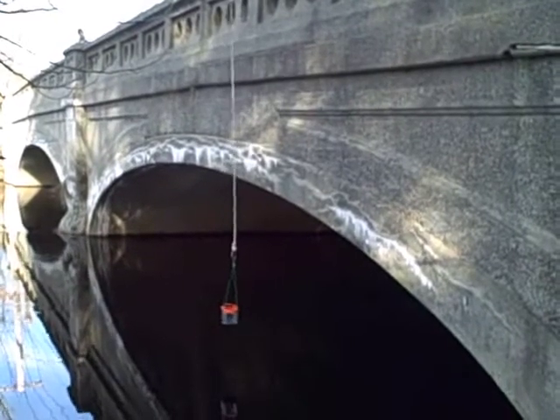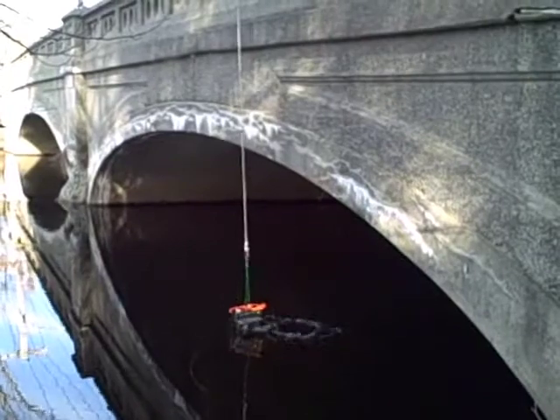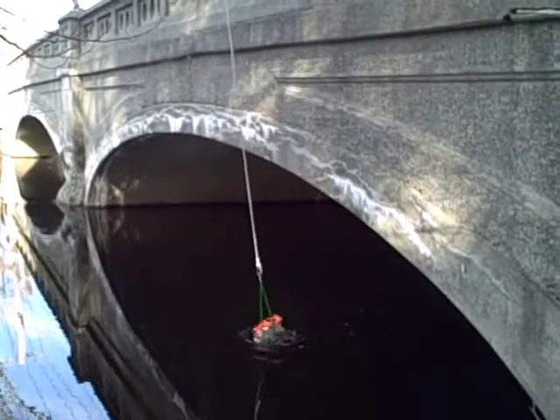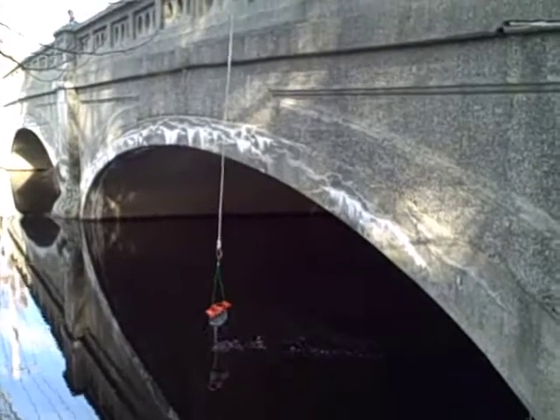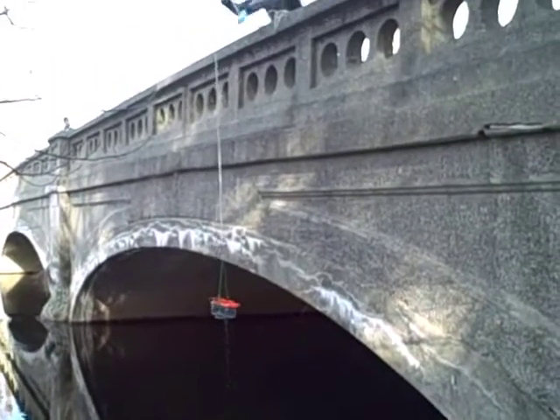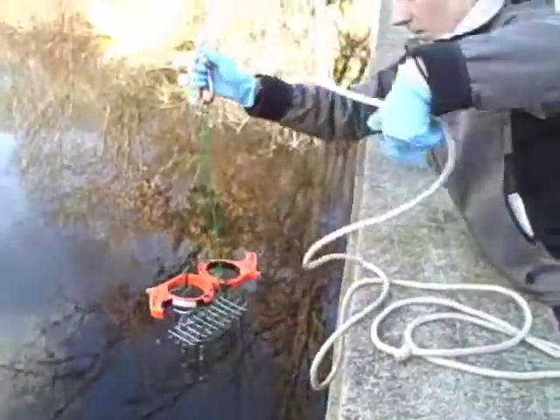Lower the basket, making sure not to hit any part of the bridge on the way down, and submerge it 3 times, so that the orange cuffs are 6 to 10 inches under the surface. You should be able to do this without getting the cloth rope wet. Once rinsed, carefully raise the basket back to the top of the bridge, avoiding contact with the bridge and the loose rope, and place it on a sturdy surface.